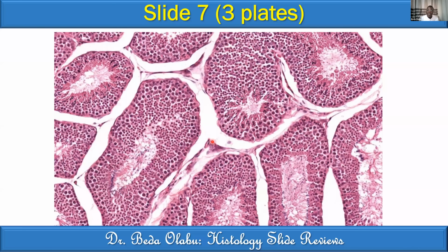Commonly, we require you to know about the ultrastructural features of the cells of Leydig. Remember, they are steroid-producing cells. They produce steroid hormones. Because they produce steroid hormones, we then expect them to have features of a steroid synthesizing and secreting cell. So I hope you remember those features of a cell synthesizing and secreting steroids.